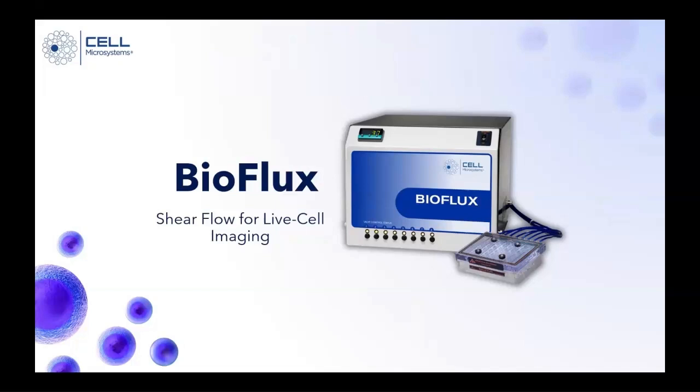However, when we were flowing the Jurkat cells and immune cells, these are non-adherent. So it just depends really on the application. But I think that would be one of the first things to look at, and then also whether or not the cells that we're thinking about live under flow in vivo conditions.